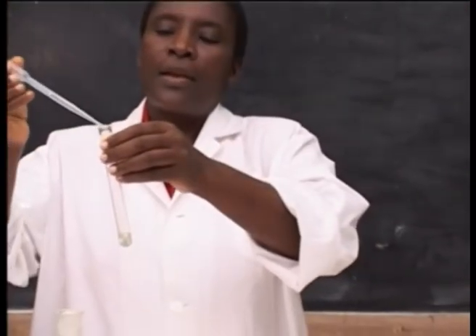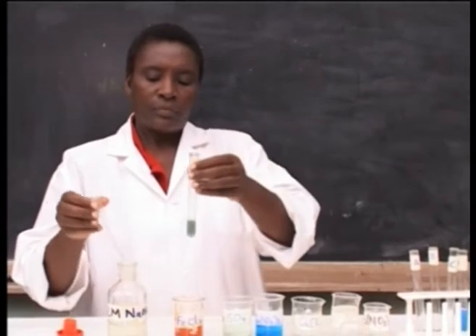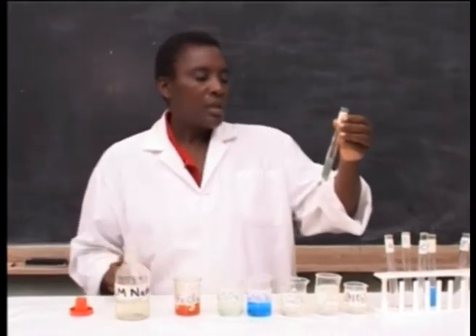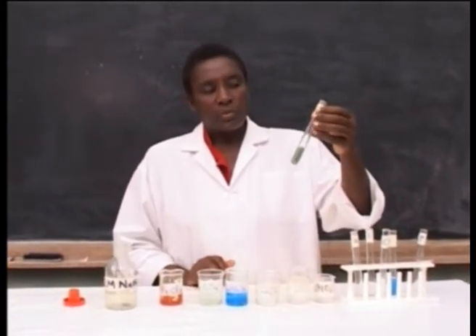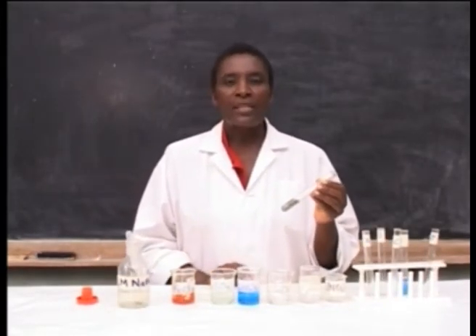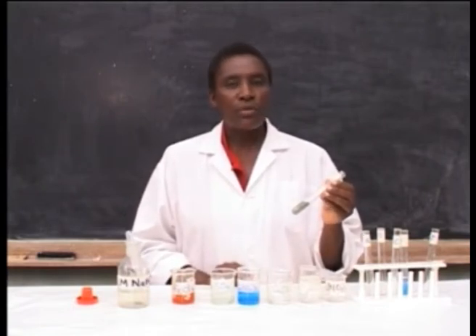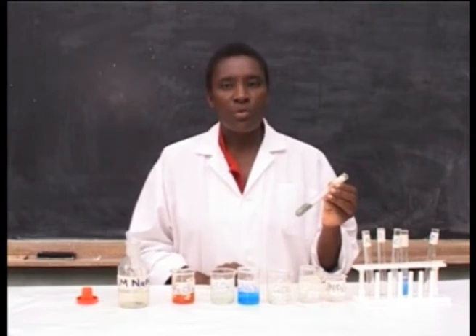Then add more sodium hydroxide solution. In test tube E, in excess of sodium hydroxide solution, there is a formation of iron 2 hydroxide, which is insoluble.